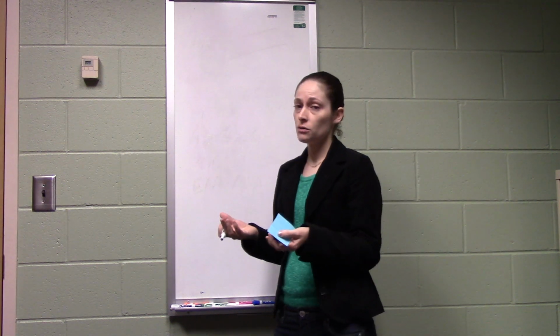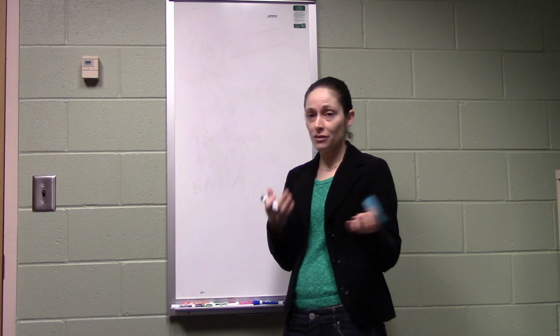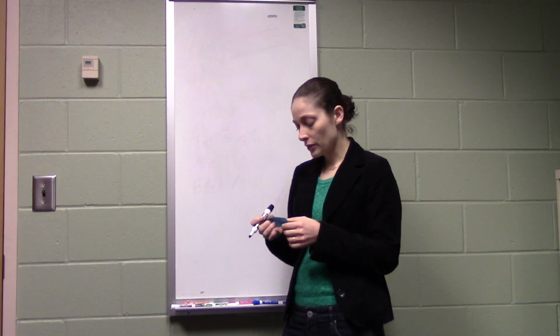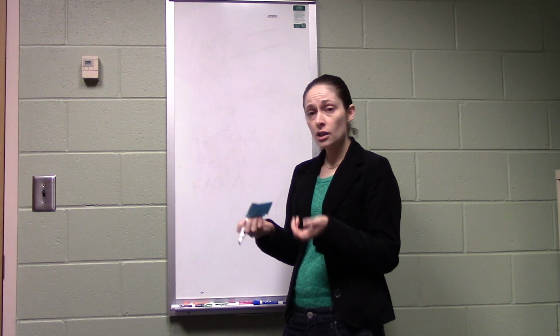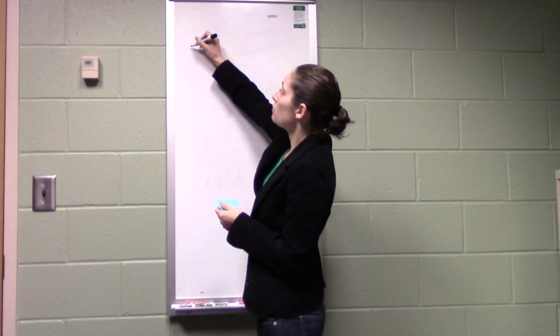So we picked one of these regions to amplify in a PCR reaction to show you all what alleles you have and to demonstrate the techniques of PCR. So PCR, polymerase chain reaction. It has 3 steps.